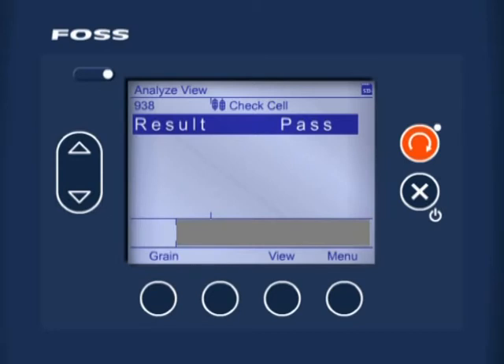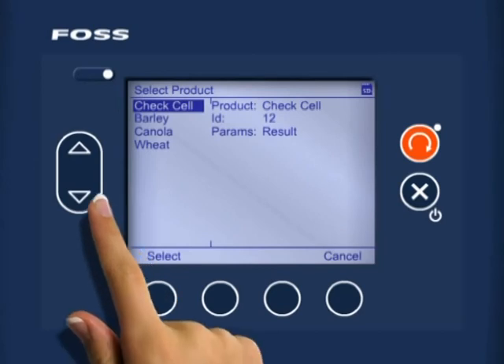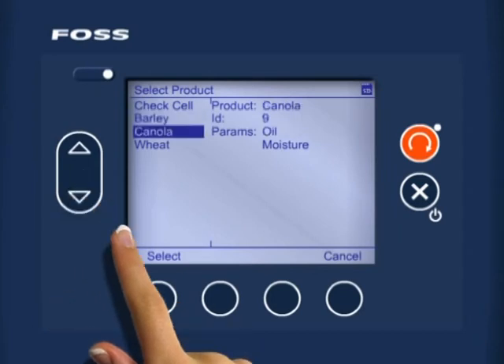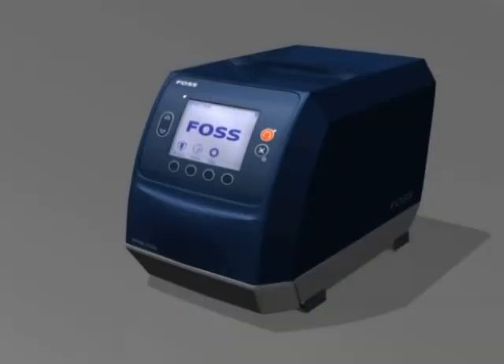Press the soft key 'grain'. Use the up/down arrow keys to scroll to the commodity type that you want to test. Once the canola commodity is highlighted, press the soft key 'select' to pick this commodity. The Infratec Sophia is now ready to analyze canola samples.